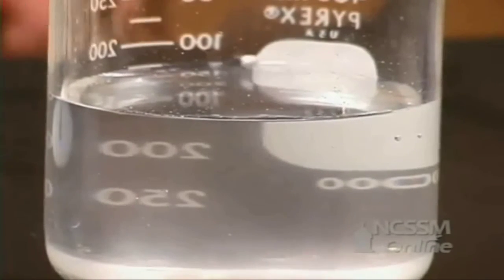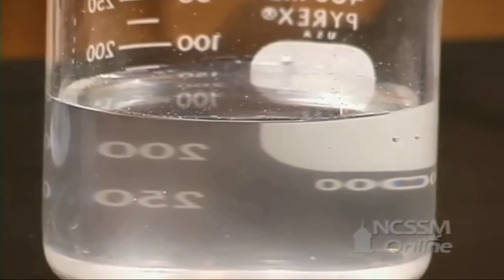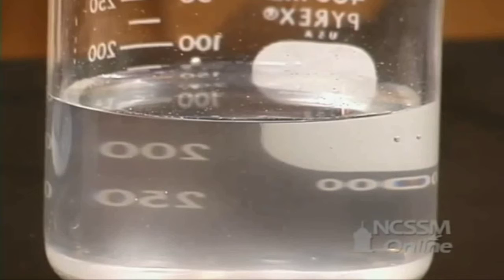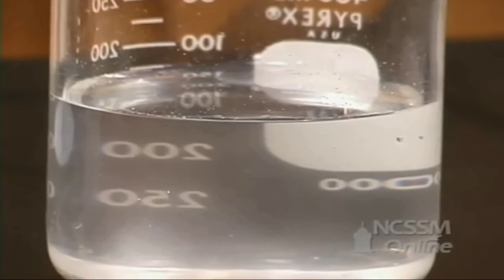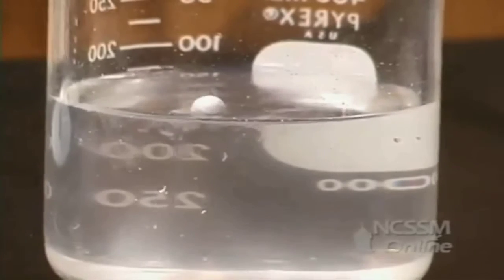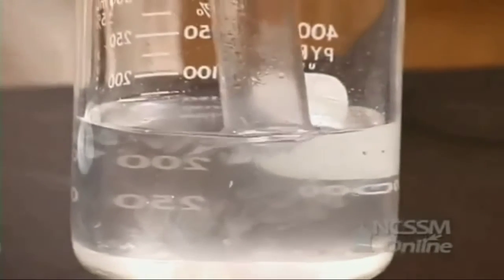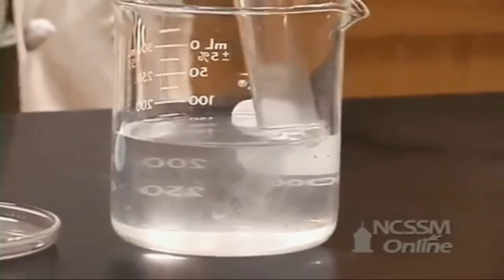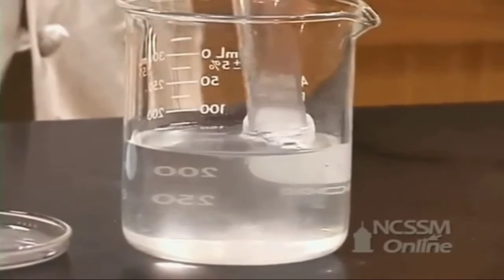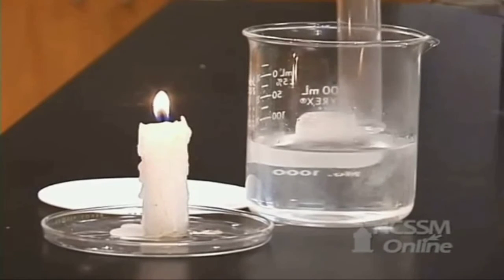As you go down the column with group 1 metals, the melting point of the metal decreases. The reaction is very exothermic, which causes the sodium metal to melt. The metal contracts into a very compact spherical form. We can again test that hydrogen gas is being produced by this single displacement reaction by trapping the gas and testing its flammability.